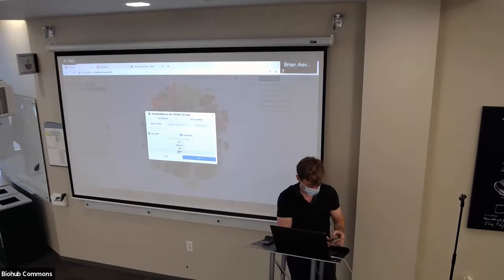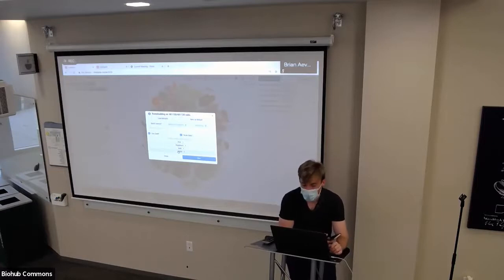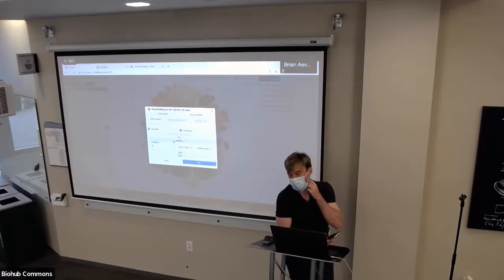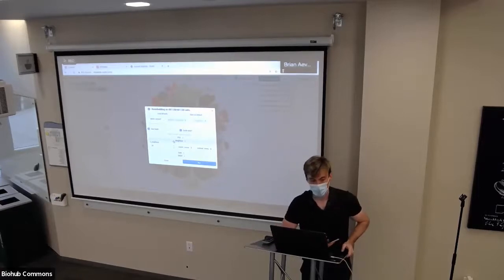Hey, I had a quick question. I don't know how much sense it makes. For the option that you have for neighbors, it basically tells, for a particular type that you have selected, the number of nearest neighbors, and it calculates the metric. Is there a way to show a small plot which shows a weighted graph, like the Sankey plot that you showed, where these are connected and the thickness of the edges depends on the weights?